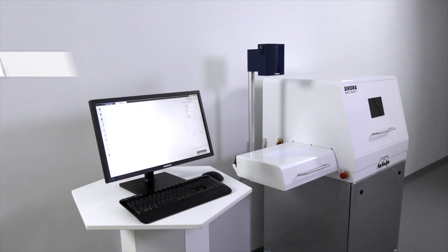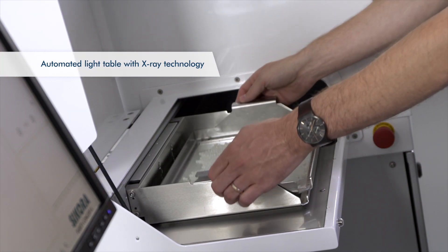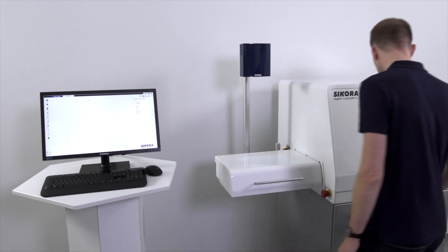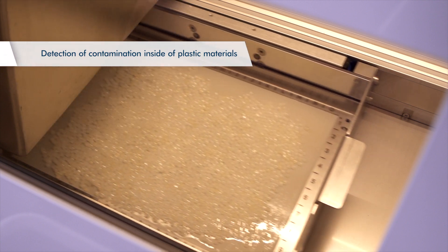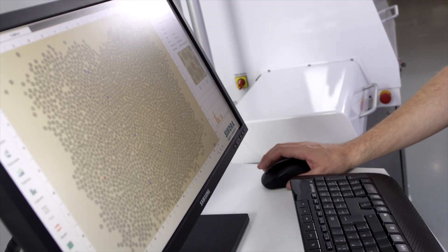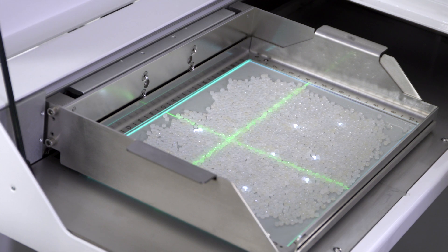Additionally, Sikora offers systems for automated sample inspection of plastic material by means of X-ray technology. The Purity Concept X detects and analyses metallic contamination on the surface and inside of plastic pellets, flakes, films, as well as sheets and injection moulded parts. The system also reliably detects inhomogeneities and vacuoles for maximum process control.